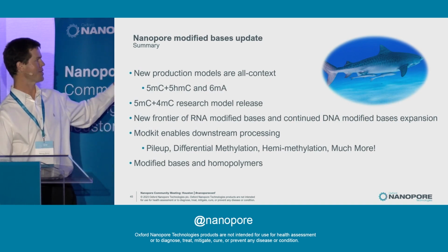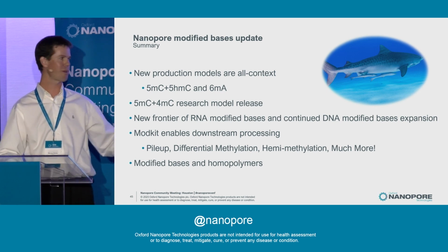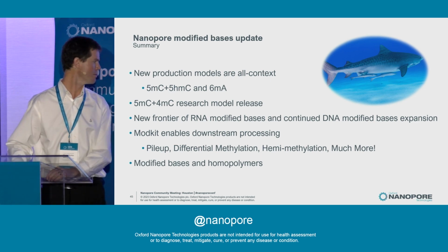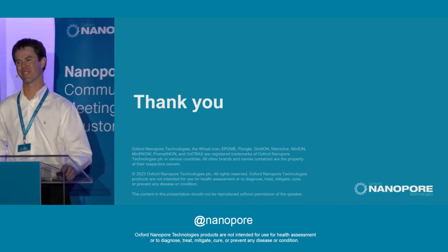Awesome. And yeah, so this is everything I talked about. The production models, our new research 4mC model, and a new frontier for RNA modified bases, continuing to expand the catalog of DNA, ModKit enabling our downstream analysis, oh, that was an old version. That will be talked about tomorrow. So look forward to that. Thank you to everybody for listening.